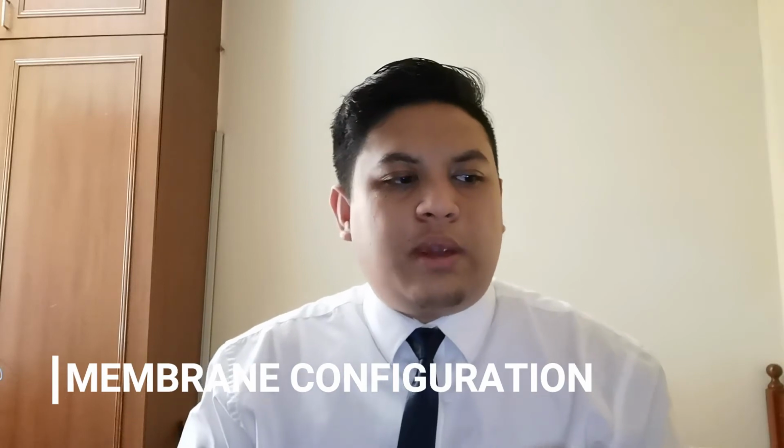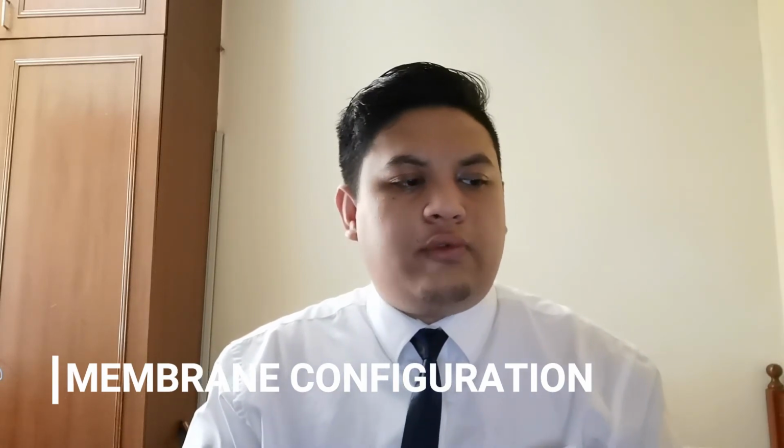Okay, thank you. Now, I'm going to explain about membrane configuration. In membrane configuration, there are four types of configuration. The first one is tubular, the second one is hollow fiber, the third one is plate and frame, and the fourth one is spiral wound.